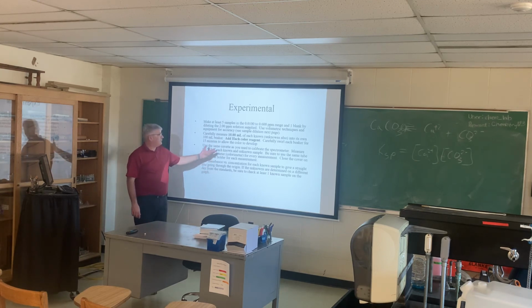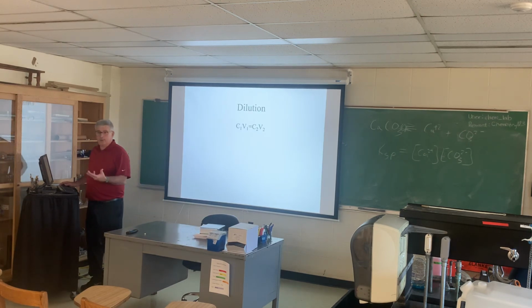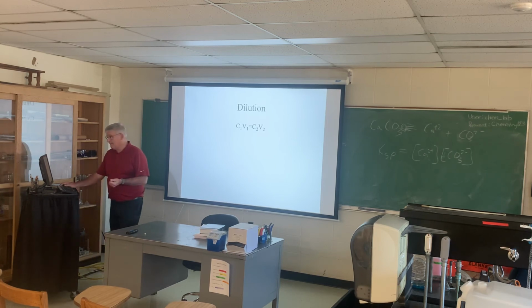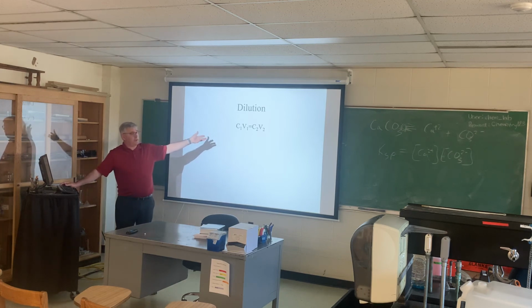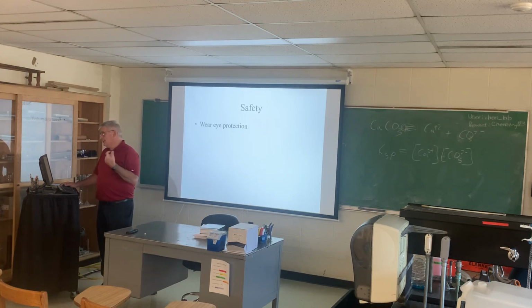So that's the project that you're going to do today. I'm going to let you fill in the details on that when you're writing your own procedure. You should be working on writing that procedure for your long-term project as you're doing today's lab. Also, a useful equation, which we used last week in lab and will use again this week: C1V1 equals C2V2. And wear your eye protection when you're working on your experiments.